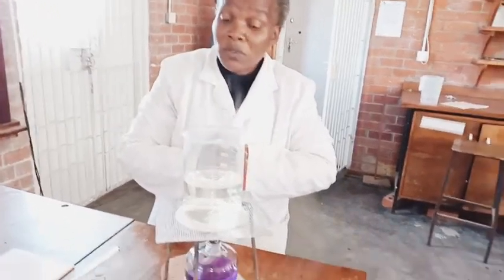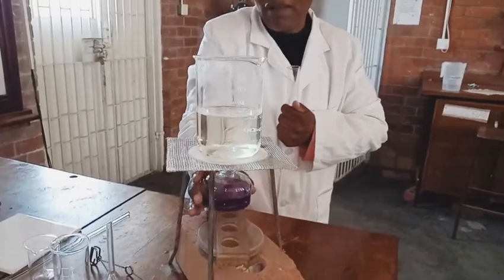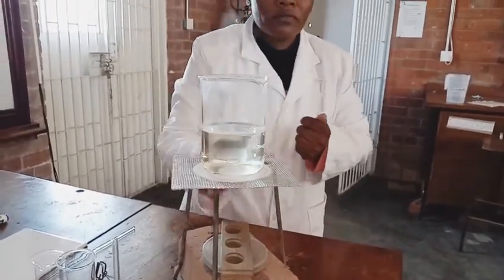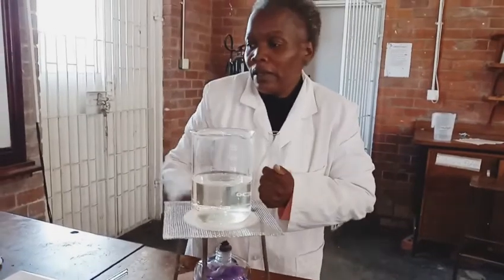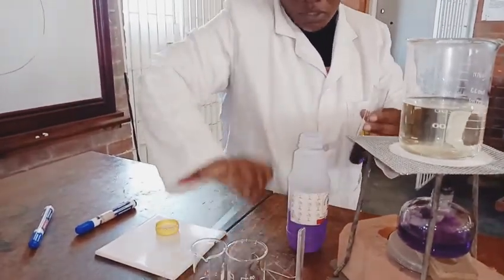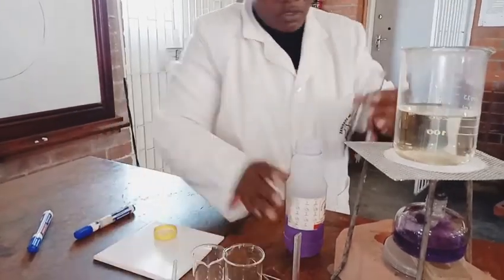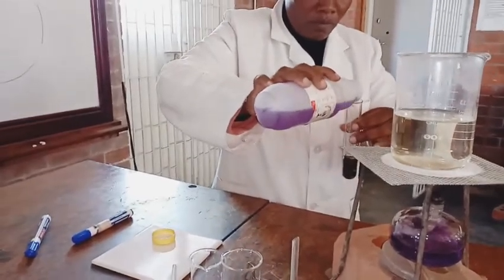Now we need to add the alcohol, and we said at this stage there is a safety measure we must observe. The burner is on down there, but alcohol is highly flammable, so we must put off the burner flame before we proceed. Now I am going to add alcohol - let me put it down so that we don't use too much. Covering them up completely.